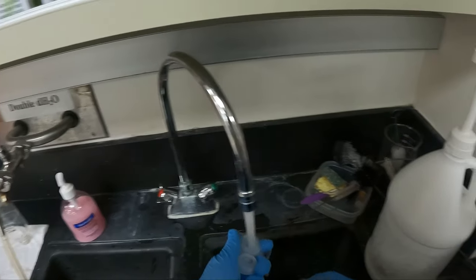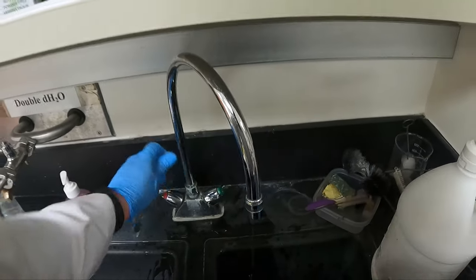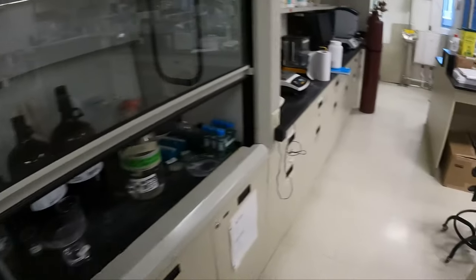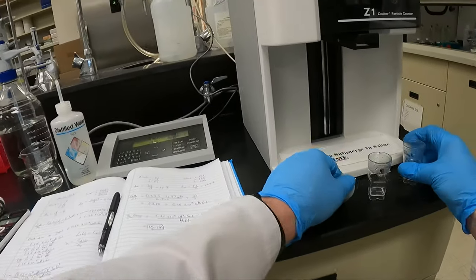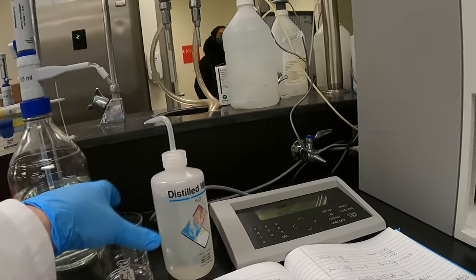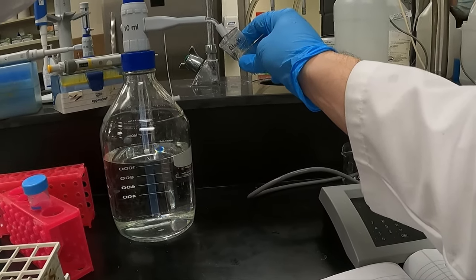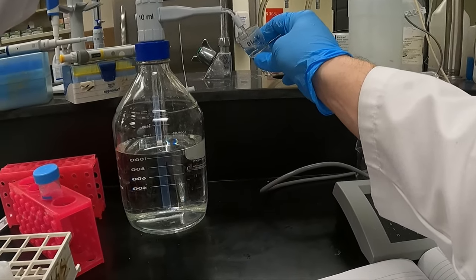Now, as I said, 4.56 times 10 to the 3 was a very challenging dilution. It's a very low concentration, and any deviation in your samples can lead to vast changes in your percent error. Just out of interest's sake, I'm going to run sample number 2, dilution number 2, and see how I did with that one. It was 1.35 times 10 to the 4. Remember what I said. When I ask you to do this for your assessment, I will not be asking you for a concentration below times 10 to the 4. Let's just see what sample number 2 looked like.